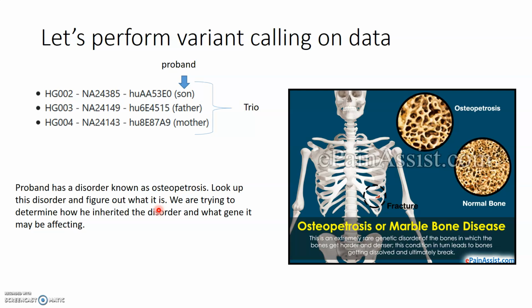Basically our job in this particular activity is to discover the genetic variant that may be causing this particular child to express that phenotype, and whether he inherited that disorder from the mother or the father.